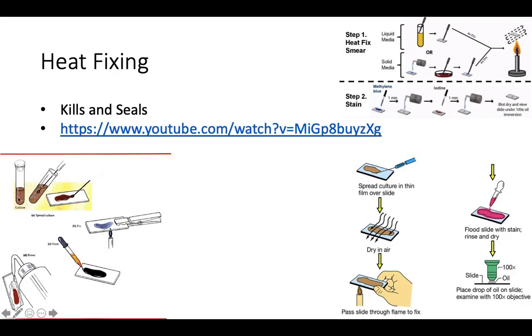You can see that down here. They've got the culture here, a little petri dish or a culture broth tube or anything like that. You can see the petri dish up here. And they take a little sample from that and they spread it onto their slide or whatever. Now, that little sample is going to have living bacteria inside of it.